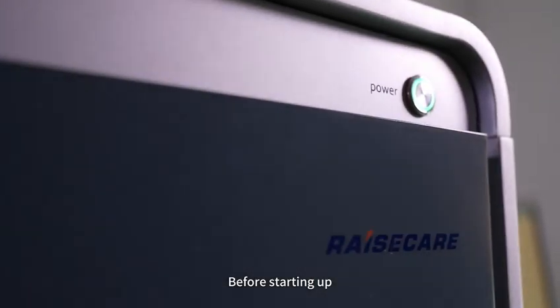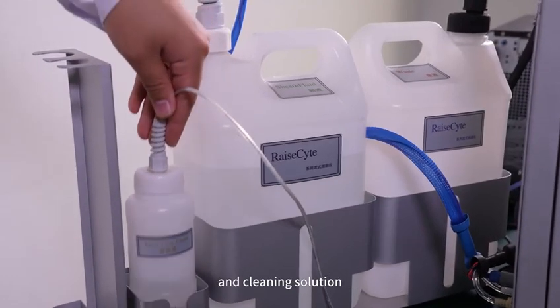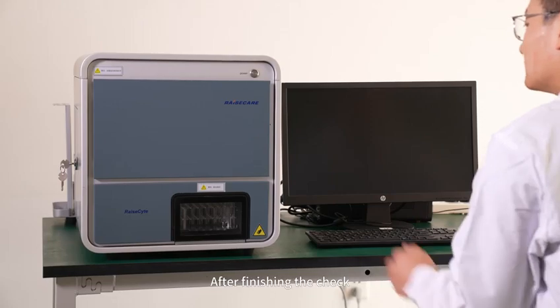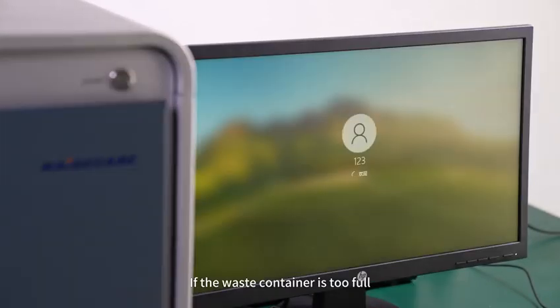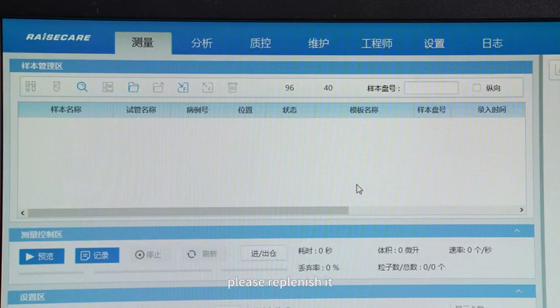Before starting up, please check if there is enough sheath fluid and cleaning solution, and whether the waste container is full. After finishing the check, turn on the instrument and computer power sequentially. If the waste container is too full, it needs to be emptied. If there is insufficient sheath fluid, please replenish it in a timely manner.